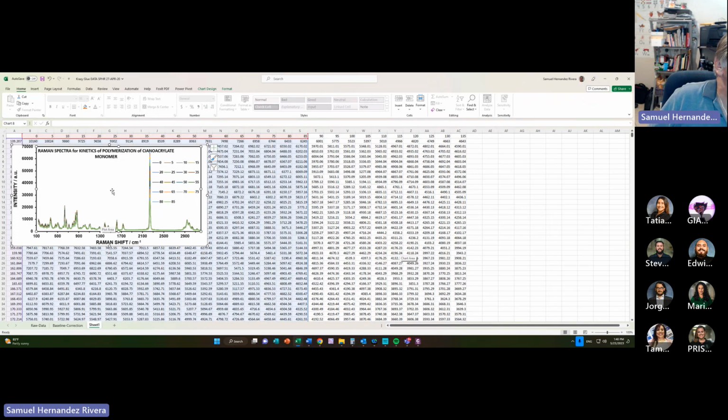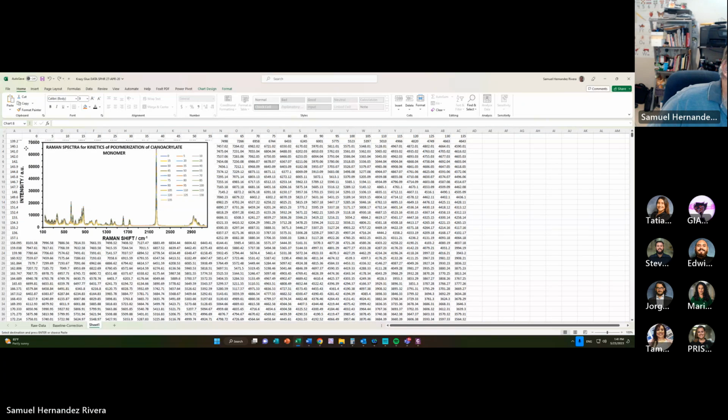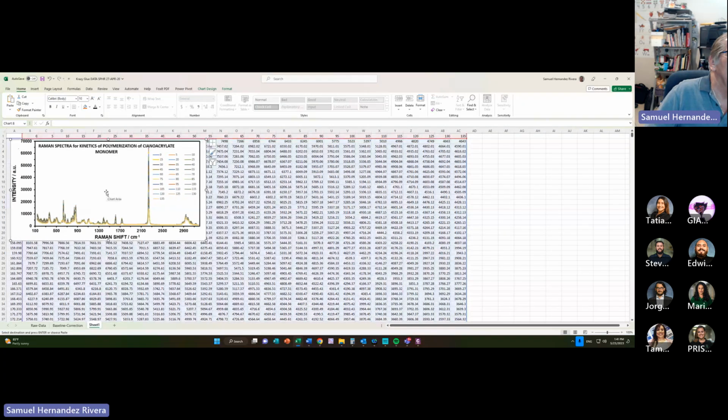Oh, I know why. Okay, let me undo everything. I have to work backwards. And I have a way of checking out. Remember that I moved the graph all the way to the left. So if I overdo, the graph should move to the right. Okay, that's it. It moved to the right.